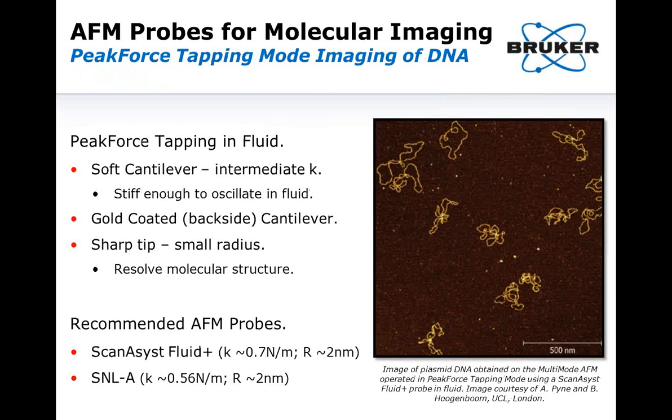PeakForce tapping for molecular imaging is used for imaging DNA in fluid. Here again, we need a very sharp tip for the resolution of the molecule, but now we are using a cantilever soft enough and with an intermediate spring constant. The cantilever must still be stiff enough to be able to oscillate in fluid. The recommended probes here are the ScanAssist fluid or the SNL-A probes.